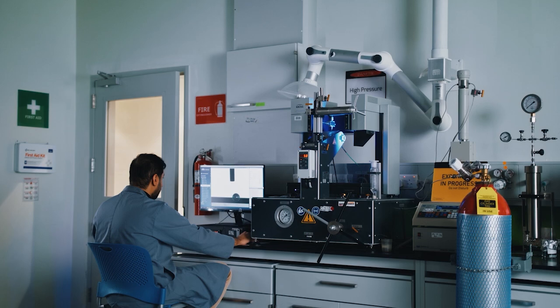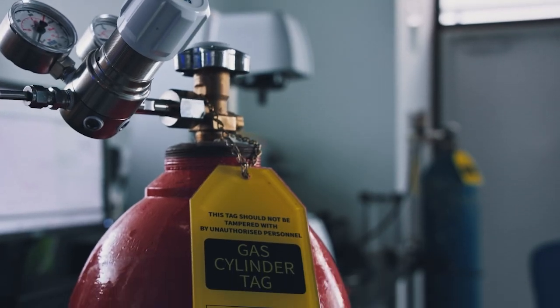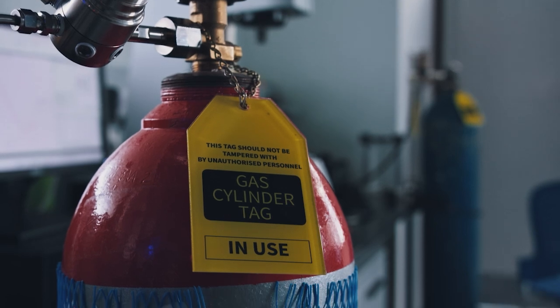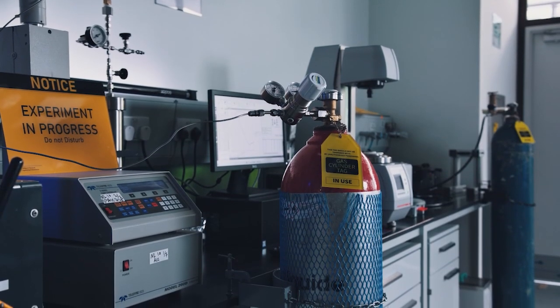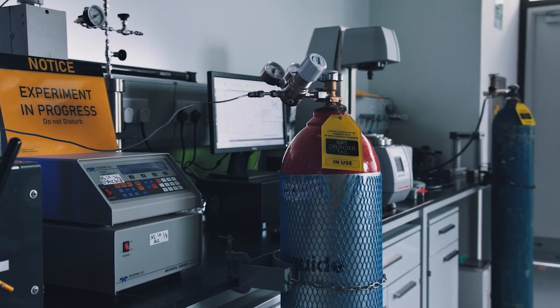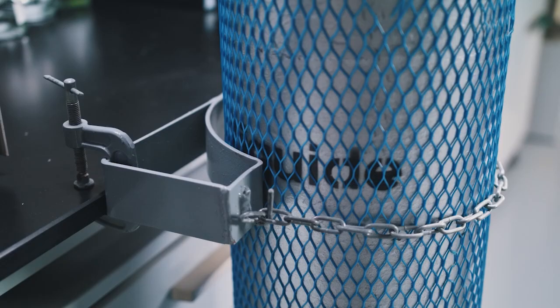While some laboratories now pipe gases in from a central storage location, many labs continue to use compressed gas cylinders to store and distribute the gases. There are special regulations governing the utilization of compressed gas cylinders. Cylinders should be located away from any sources of flames or sparks. Strap or chain them to benches or walls so they would not fall.